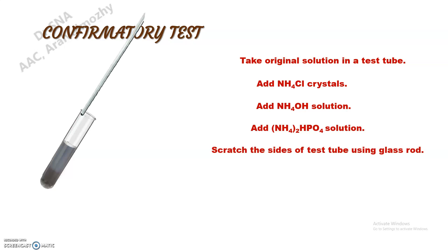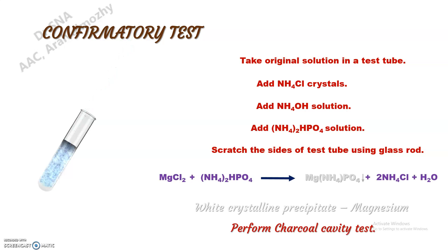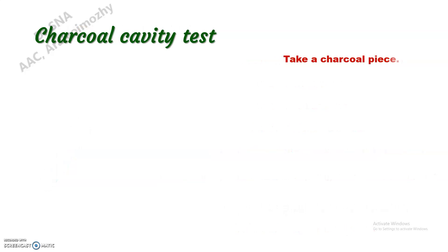Now we can see the white crystalline precipitate of magnesium ammonium phosphate. This is the confirmatory test for magnesium. We can also perform the charcoal cavity test. For the charcoal cavity test, we have to take a charcoal piece and make a cavity in it.